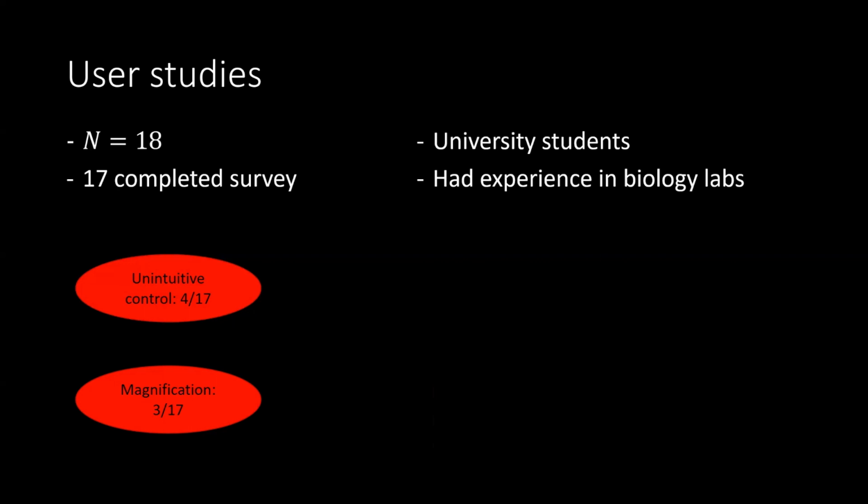Our magnification choice did have other constraints. We did not have a moving stage, so the entire microfluidic maze needed to fit within the field of view. And since we also wanted the maze to be recognizable as the Pac-Man maze, it had to be relatively large in order to let the Euglena move around more freely. In future games, we would probably choose to either use a simpler and smaller maze with fewer corridors, or implement a moving stage to follow the cells around.